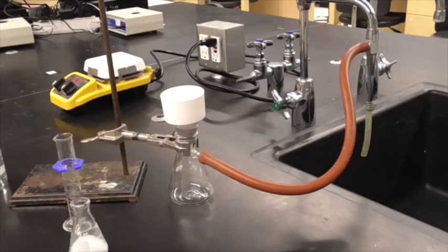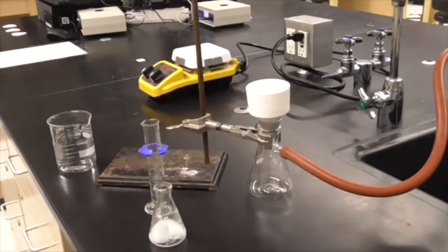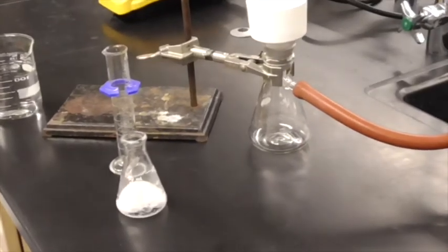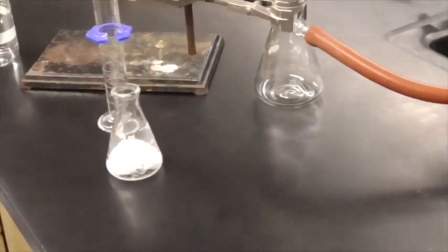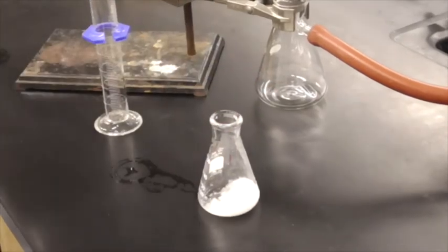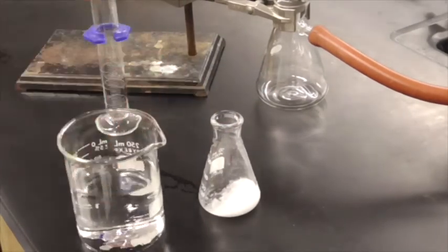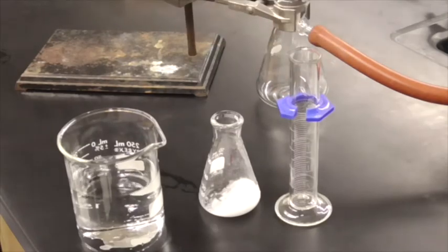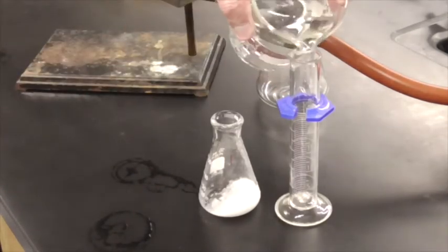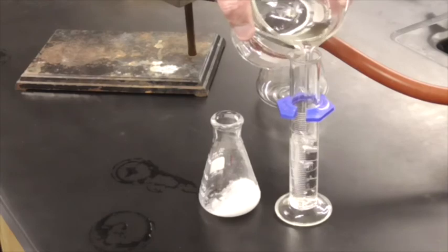Okay, so we're back here. I'm going to zoom in on our product here a little bit. So we have our product, and it says to add 20 milliliters of distilled water to it. And I've chilled the distilled water right here, and I've got a 25 milliliter graduated cylinder. So I'm just going to add about 20 milliliters of this ice cold water to it.